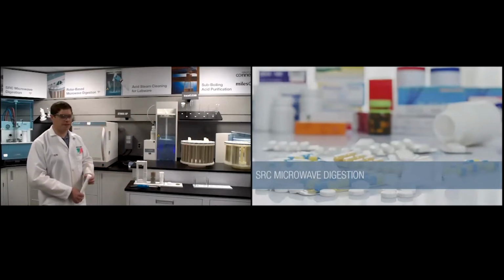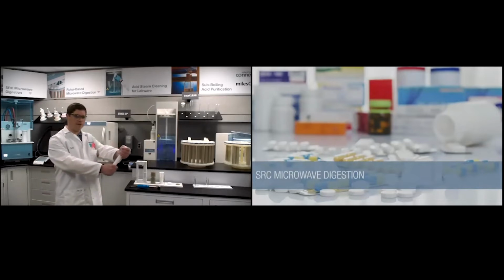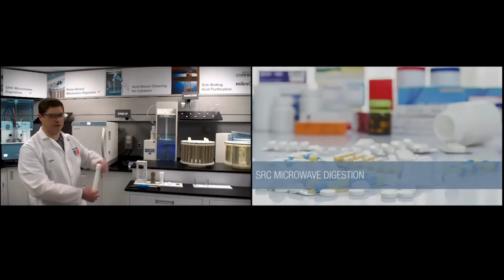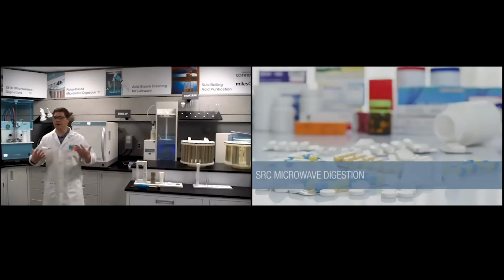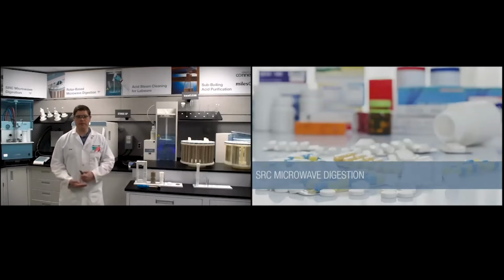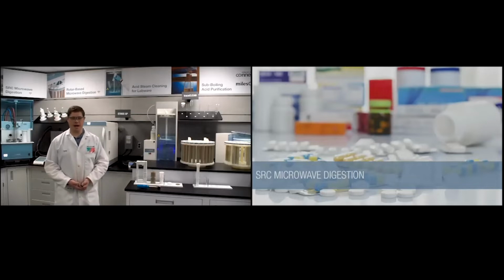So with a rotor-based system, though it may automatically cool off, when you go to open up your vessels, you do need to depressurize each individual reaction vessel under the fume hood. And also, depending on your detection limits, you may require some additional cleaning of your vessels. So in order to overcome these limitations of rotor-based technology, that's where we came up with the single reaction chamber.